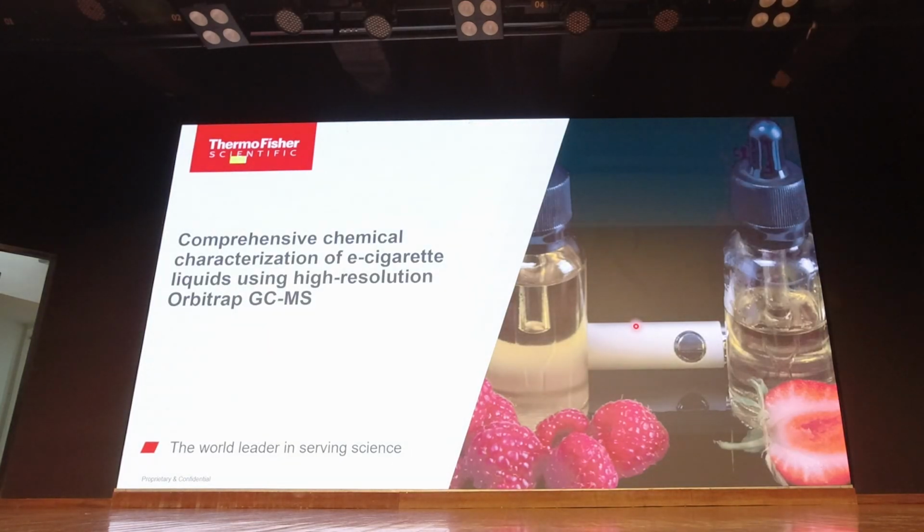I am coming to some key applications. My colleagues will cover those applications, but here are some typical applications which you may not have heard of. You must have heard about e-cigarettes, which are getting very popular. A lot of youngsters do vaping. But is it really safe? So we wanted to find out what is there in the vaping solution, in the liquid. So using high resolution, we tried to find out what is there in this solution which is used in e-cigarettes.